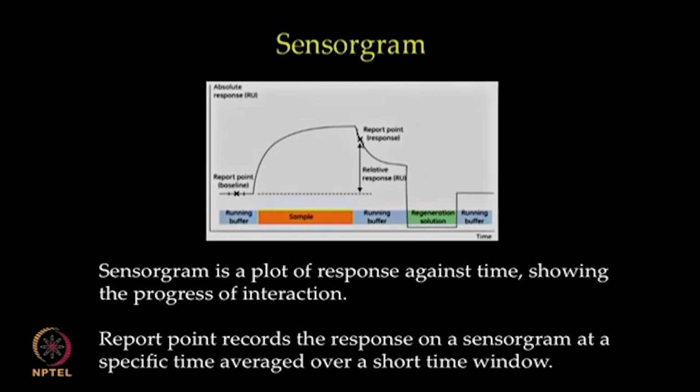We will now proceed to analyze the data obtained from binding of anti-beta-2 microglobulin with beta-2 microglobulin protein.